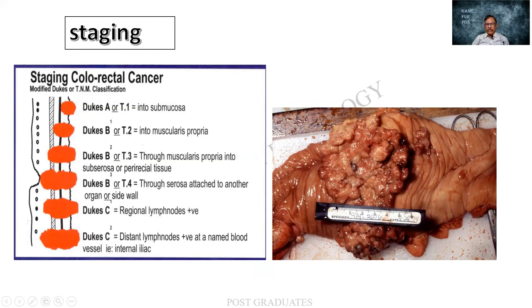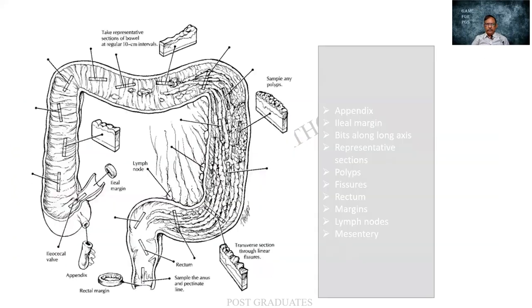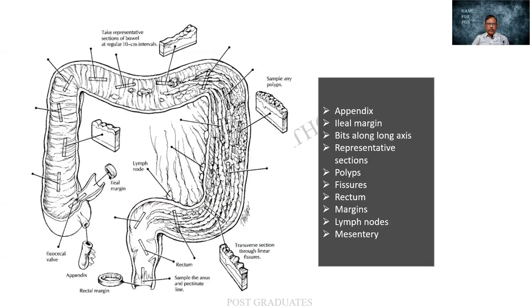And the measurement, as I told you, it is generally the length and the breadth that we count, but also the circumference we should be taking into account. And look at this. Though it is large, ulceroproliferative, and capacious, you find that it will not be causing an obstruction because the cecum itself is quite large. This appears to be a very simple diagram of paramount importance.